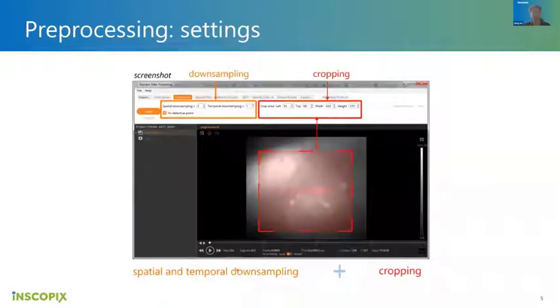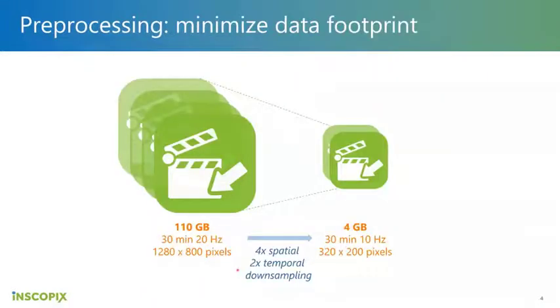Sorry, Jonah, I have a quick question. Are you planning to mention the type of file that we can input in IDPS, such as the type of formats, for example, isxd or TIFF files?